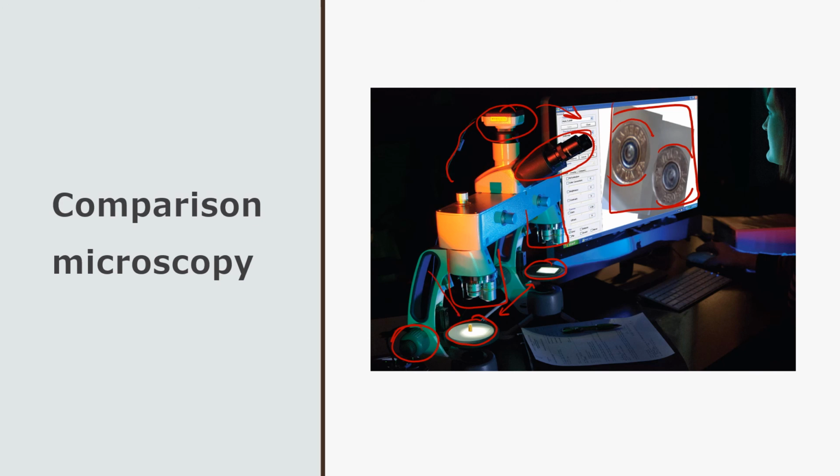You're going to take a standard reference sample and your suspected evidential item and compare them side to side. You can line up striations. You can confirm manufacturer information. You can look at class or individual characteristics with your standard reference item and your potential evidential item and see them side by side.